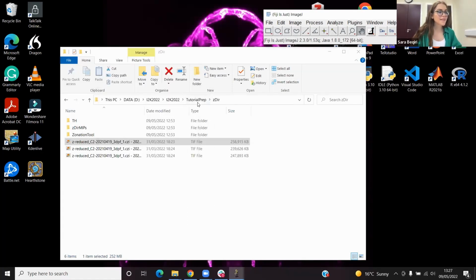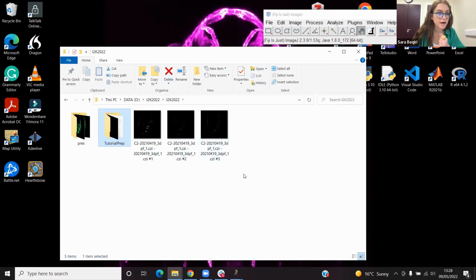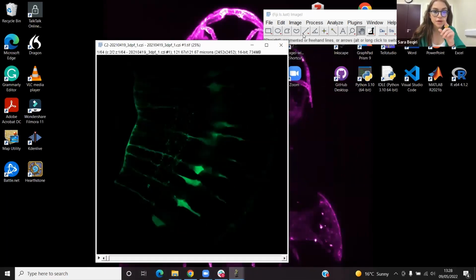Yes. Okay, so you open the folder, you can drag one of the images onto Fiji. Click okay, let's just wait for a second. All right, and when it opens, you click on the line selector, which is there, and you draw a line from the inner part of the retina extending outwards in each image.